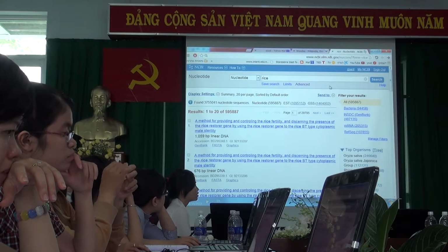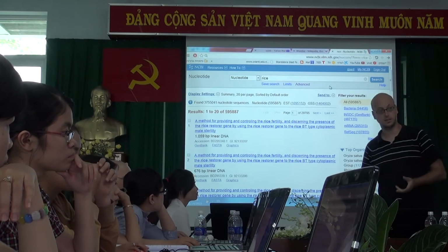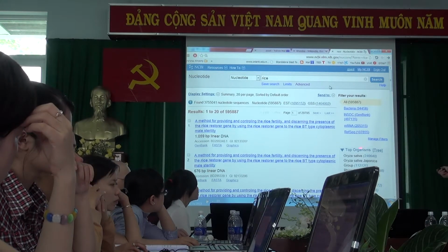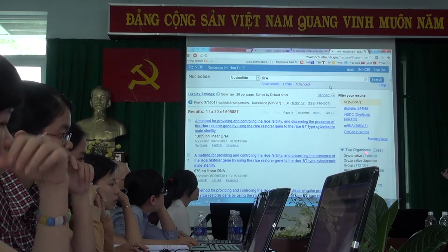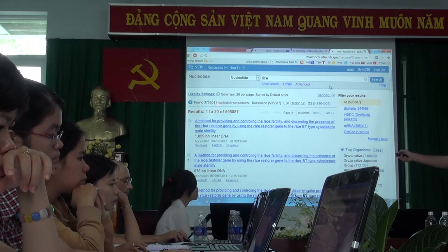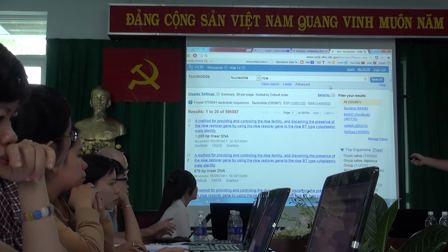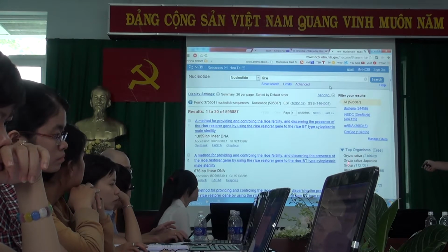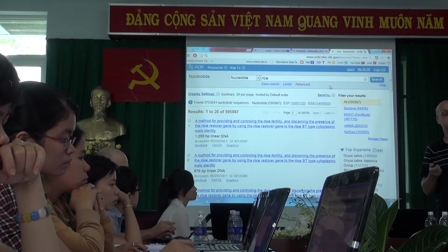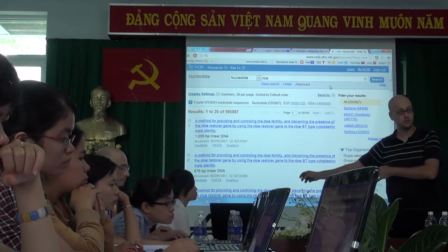I want to show you a few very powerful filters. So we've already talked about the taxonomy filter. So from those 600,000 results, I can choose just one species and delete all the other results.